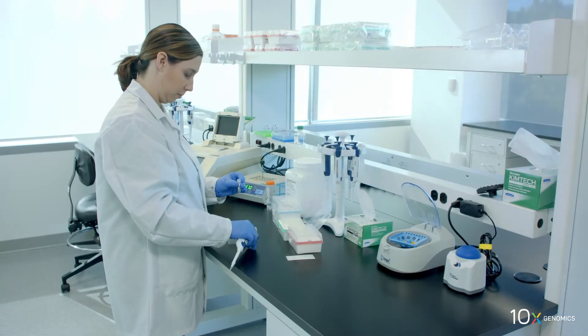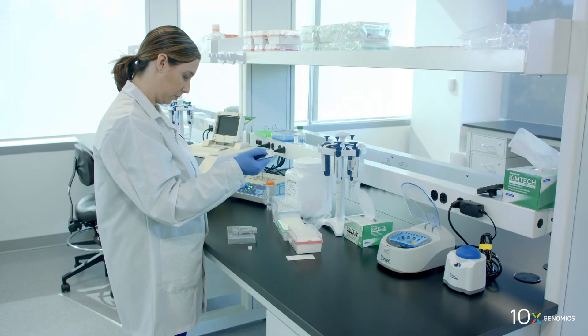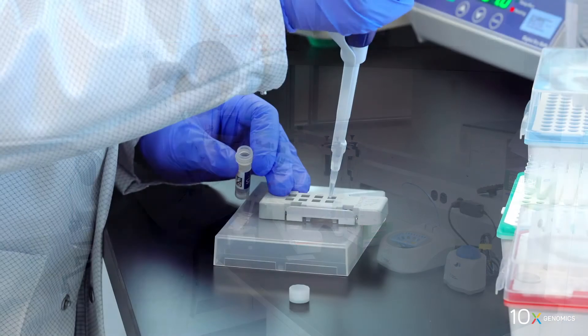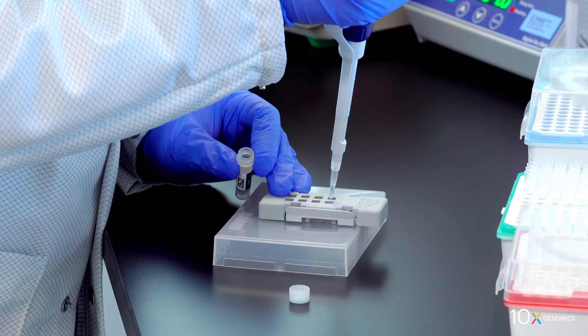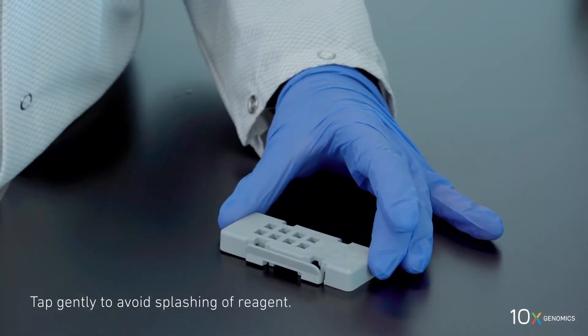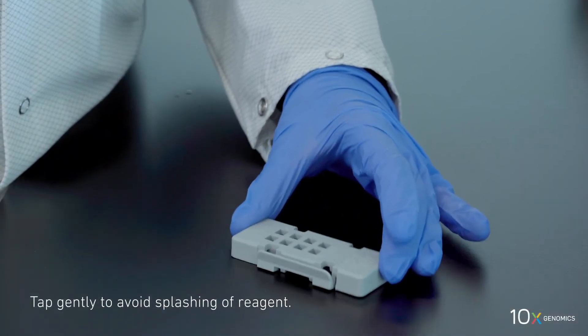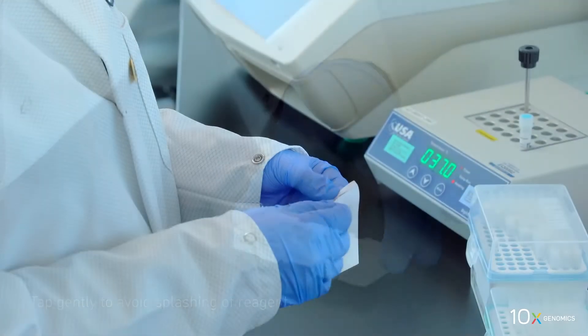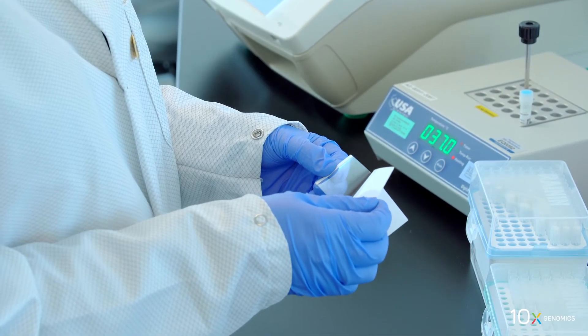Add 70 microliters resuspended permeabilization enzyme along the side of the wells to uniformly cover the tissue sections without introducing bubbles. The slide cassette may be tapped gently to ensure uniform coverage. Remove the back of the adhesive slide seal.